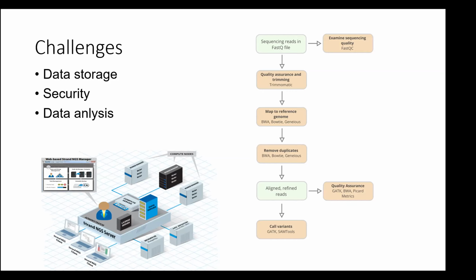And the challenge is also to create new analysis pipelines and to appropriately select the right tools from the many existing ones. Different DNA data analysis tools have different biases and abilities to call variants. And especially in a clinical environment, it's important to use a unified standard for interpretation of different variants.